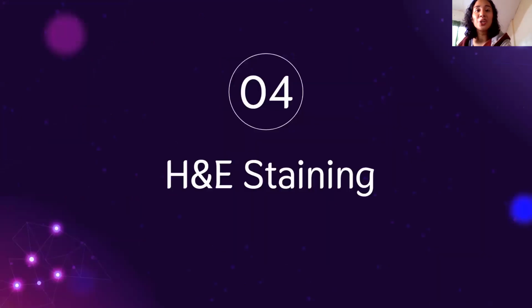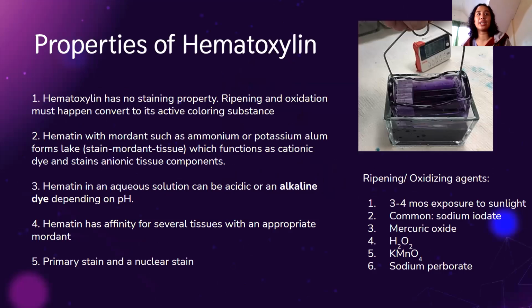So let's head on to your H&E staining na tayo. So guys, what are the properties of hematoxylin? Just like what I told you a while ago, it has no color in itself, guys. Wala siyang kulay, okay? So you need to ripen it or to oxidize it so that the active coloring substance will come out, which is your hematin.